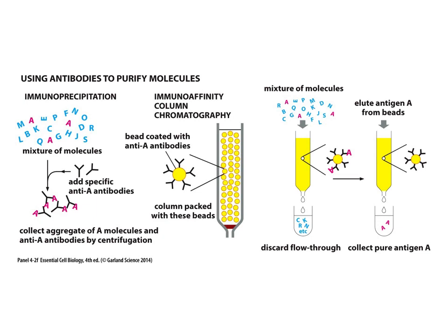If we take samples from people who have recovered, the convalescent plasma is going to have antibodies, so we could create a column with that plasma. We could pass that viral lysate over, right? And so all of those proteins that, at least for the individual we got the convalescent plasma from, that their immune system did not respond to would flow right through, right? But the proteins that are specific to the antibodies would get trapped.